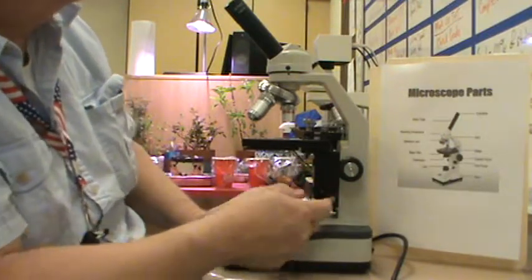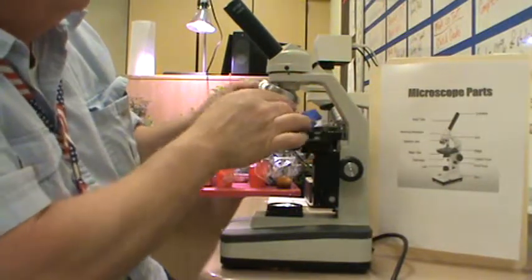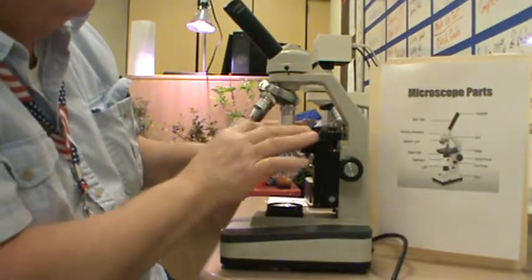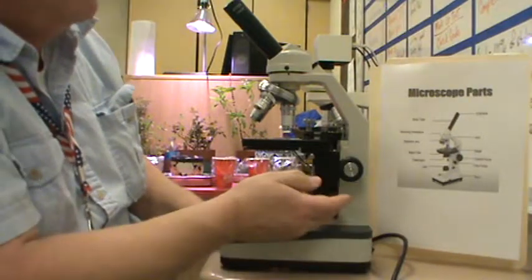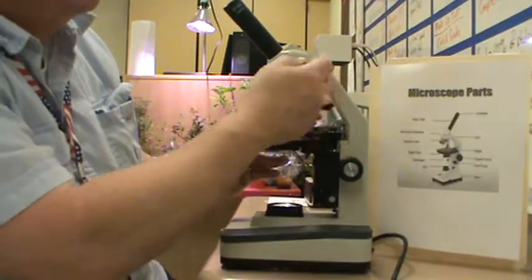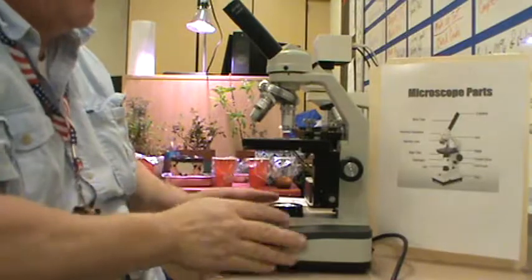So let's just review. Eyepiece, body tube, revolving nose piece, objective lenses, stage clips, the diaphragm, the light, the base, the fine focus, the coarse focus, the stage, the arm, and then we're back to the eyepiece.